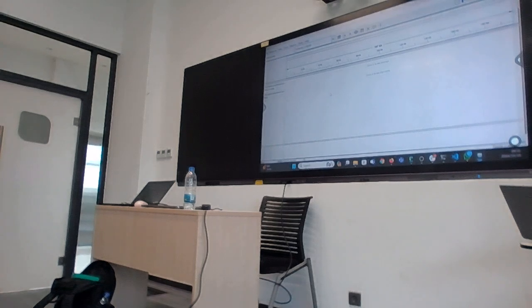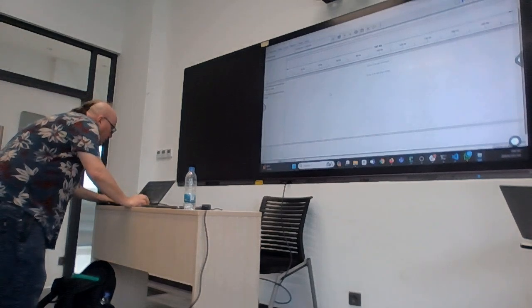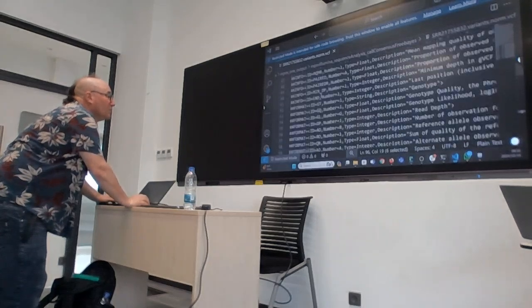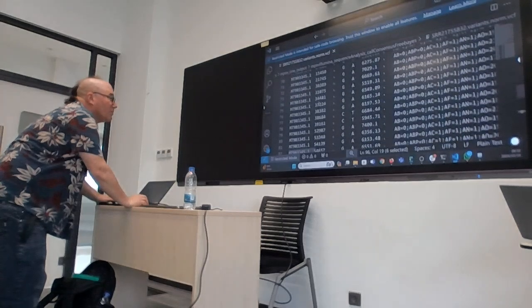Okay, so let's go to a nice position to celebrate with a nice variant before coffee break. And let's go to this nice one at the top here. So let's choose a new one we haven't looked at before.